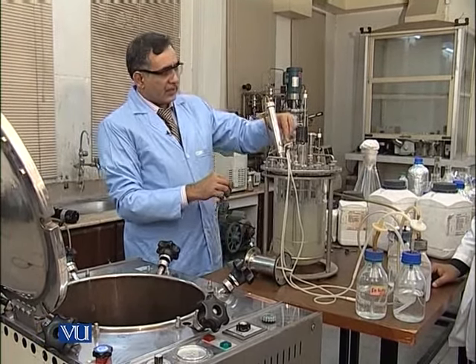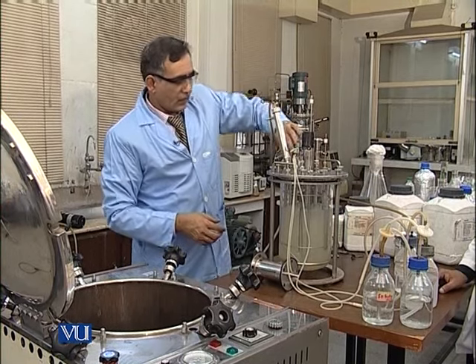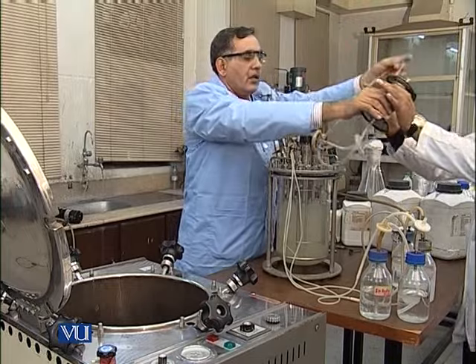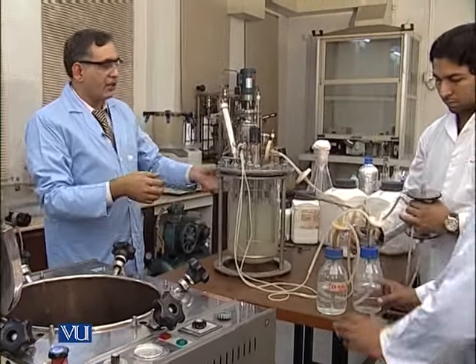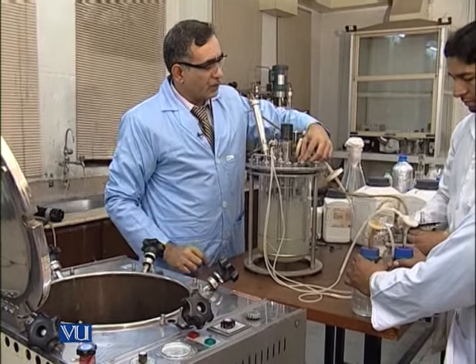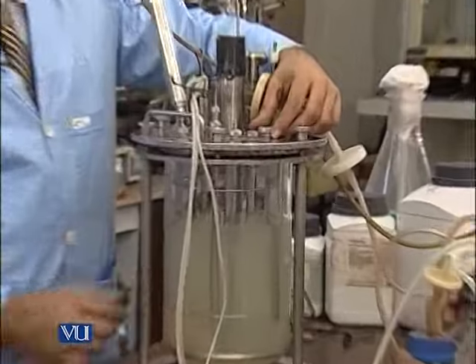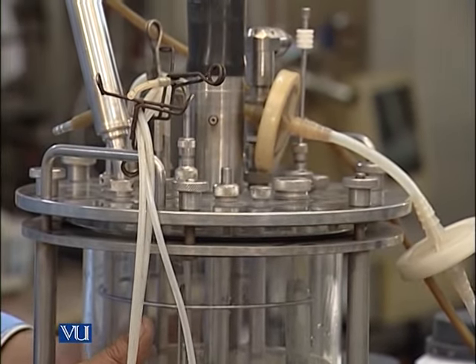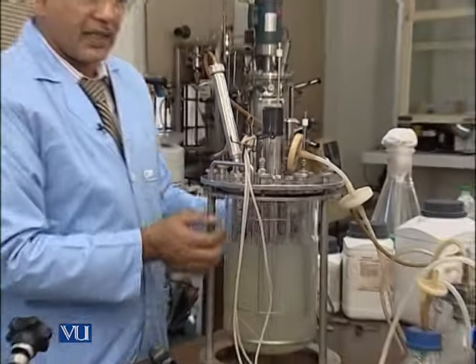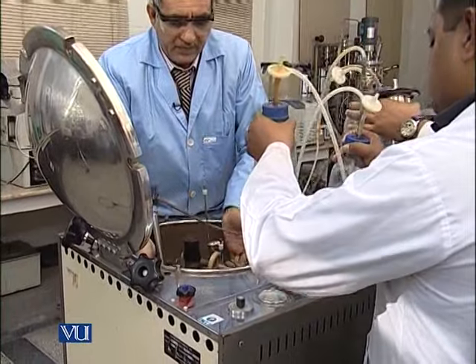So here you can see that we will attach this, but we will attach a blocker here. We will make a small cotton plug here. When this whole assembly is ready, then we put this into the autoclave, but before putting it into the autoclave, we have to loosen this plug, because sometimes during the sterilization process there is a high pressure because the media will expand. Just for the safety of this, we have loosened it, so that due to the extra pressure the vessel cannot be ruptured or blast. So we will put it into the fermenter, into the autoclave.